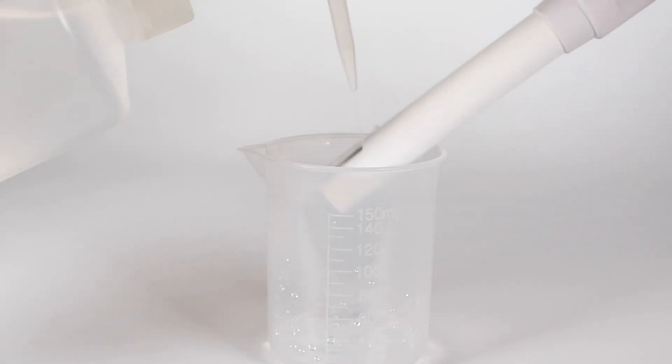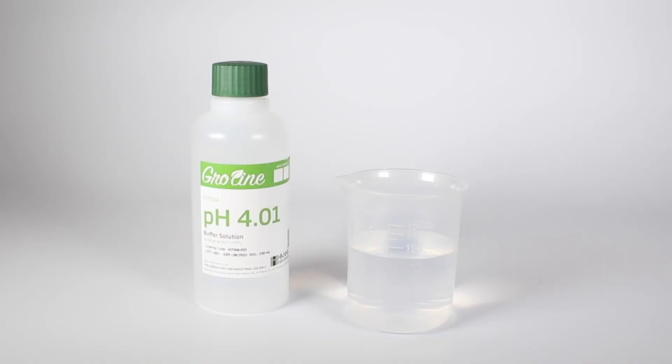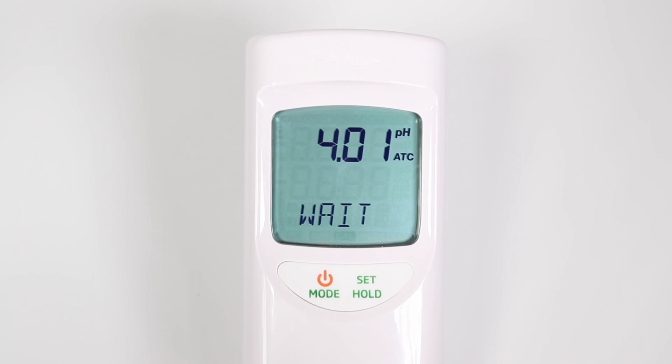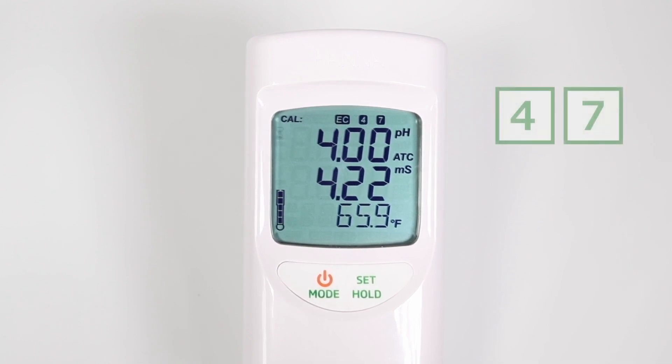The pH 4 use message is then displayed. Rinse the probe briefly and shake off any excess liquid. Place the probe in the pH 4 calibration buffer. When the second buffer is accepted, the LCD will display save for one second and the meter will return to normal measurement mode. After the calibration procedure has been completed, you will notice the 4 and 7 icons appear to show it has been calibrated.